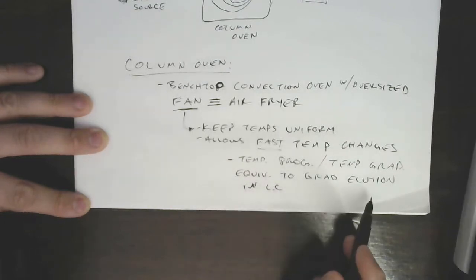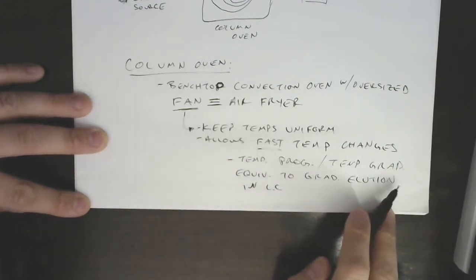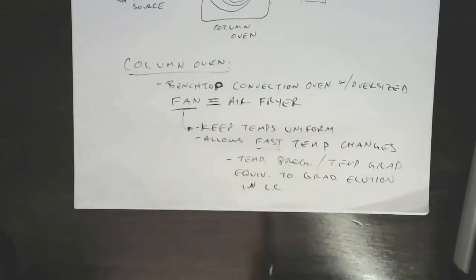In LC, we have gradient elution. In GC, we get temperature programming or temperature gradients. Works exactly the same way. You can have a step gradient. You can have a linear gradient. You can do things isothermal, which is the same concept as isocratic.